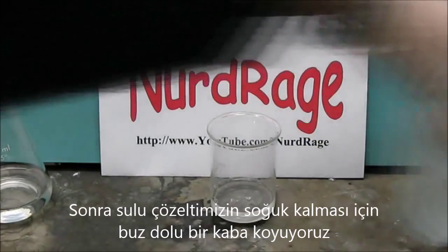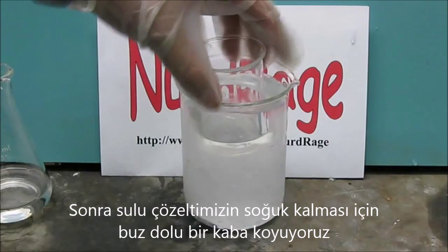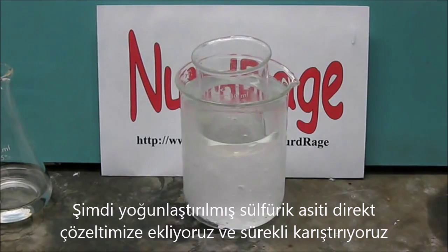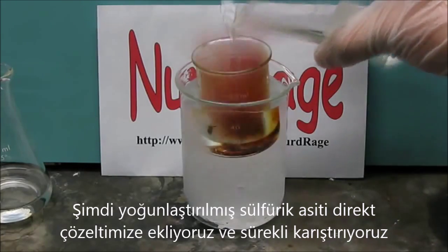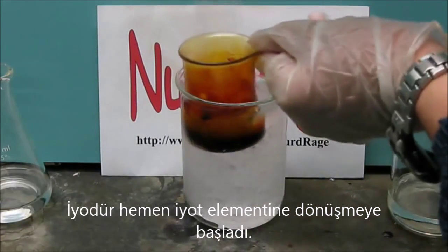Now get a container of crushed ice and water and place your iodide solution in it to cool it. This is an ice bath, and it's needed to keep the temperature under control for the next step. Now you get concentrated sulfuric acid and add it to the solution. It will instantly start converting the iodide into iodine, as you can see here.